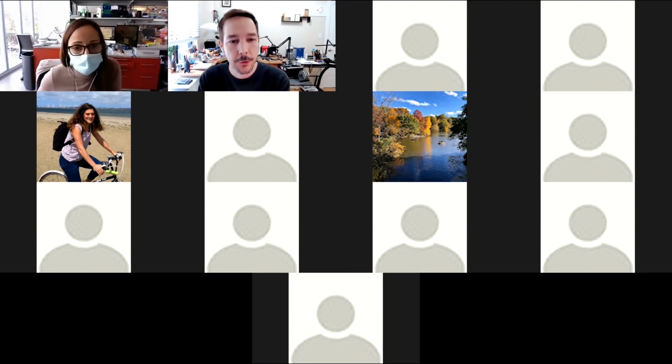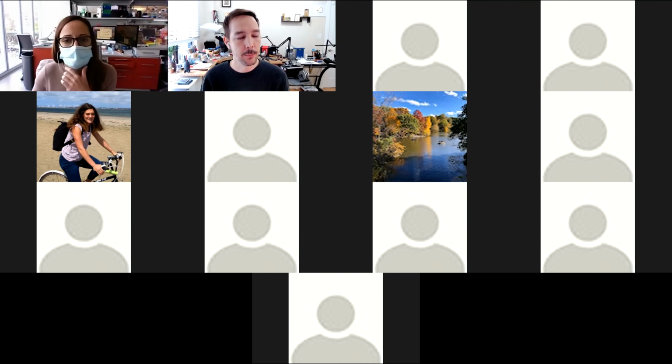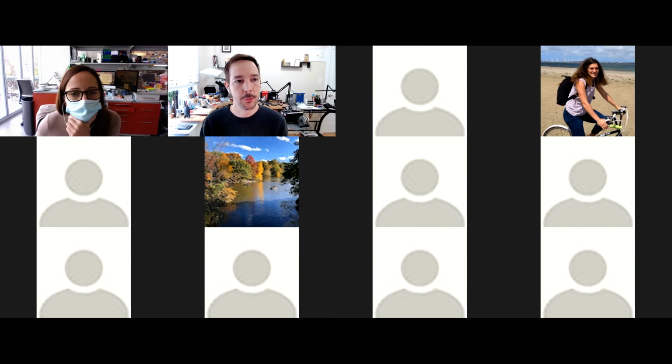So the main thing I wanted to go through today was how to automate image processing and image analysis. And we're doing this in Fiji because it's a really accessible tool, I find, for teaching biologists how to script. That's because there's less of a disconnect between typing things into a command line and what those things are actually doing. And there's a lot of flexibility in terms of using functions in Fiji and seeing how they work and incorporating those into your pipelines.